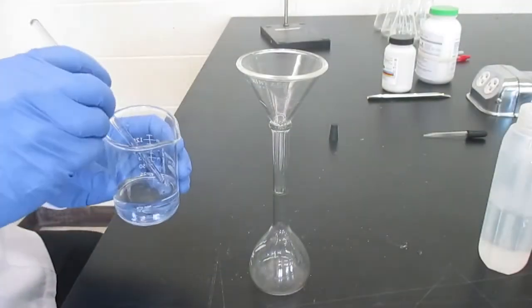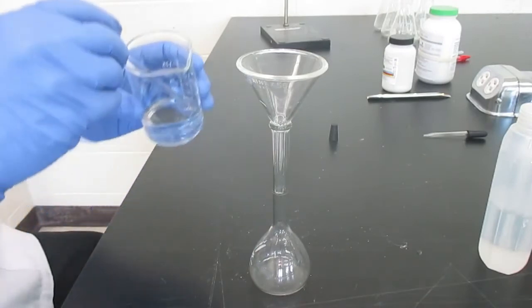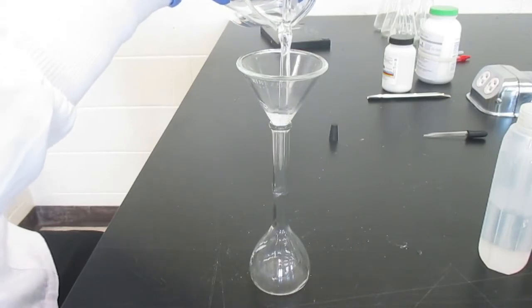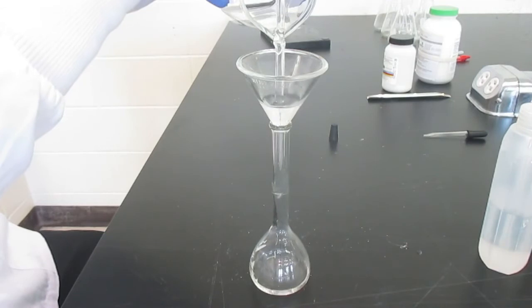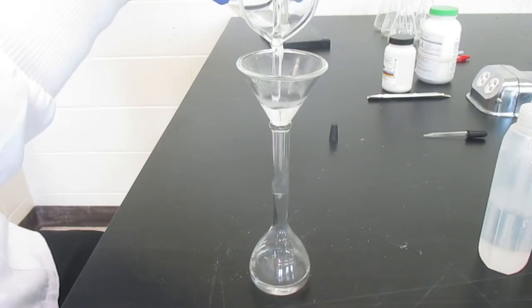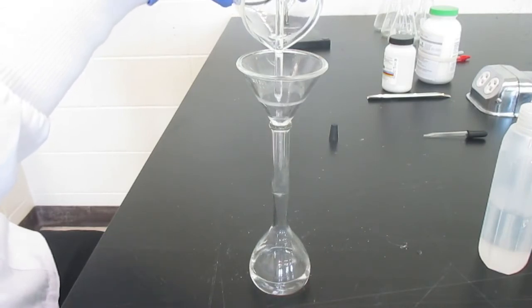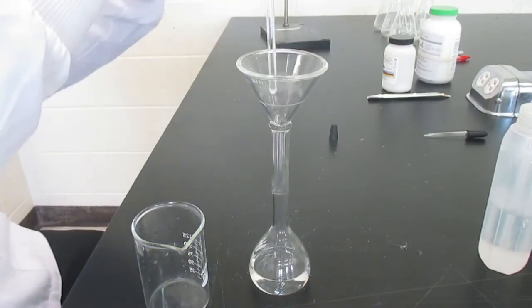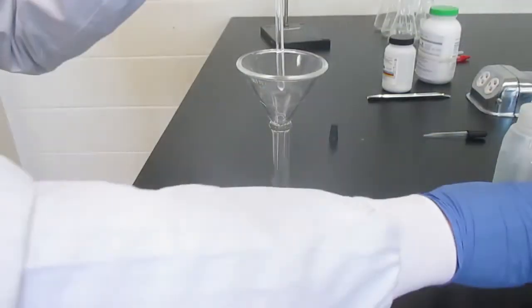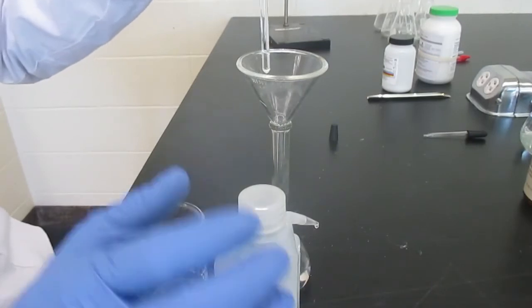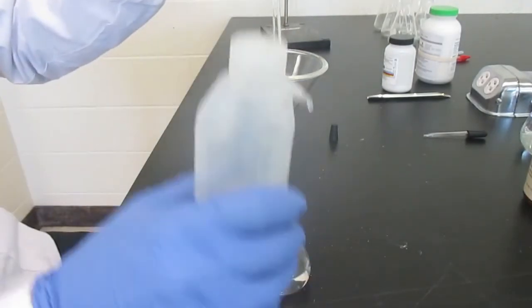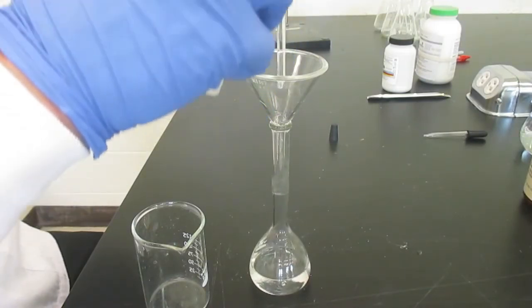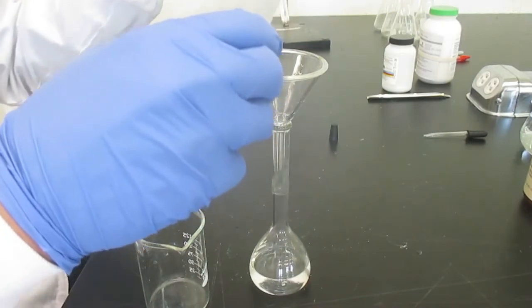So let's pour this into our volumetric flask. And I'm gonna pour down the stirring rod so that I don't spill any. And everything has to be rinsed. So the accuracy of this solution depends on a couple of things. It depends on our equipment being able to weigh accurately. It depends on our ability to transfer every single molecule that we weighed into our volumetric flask here.